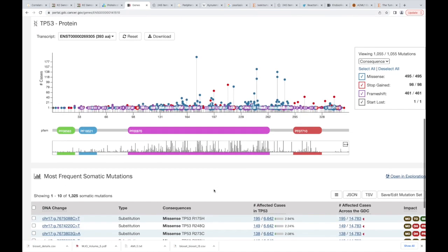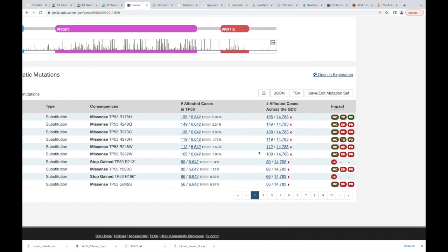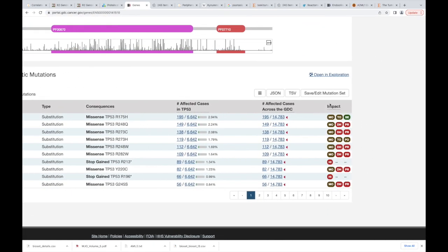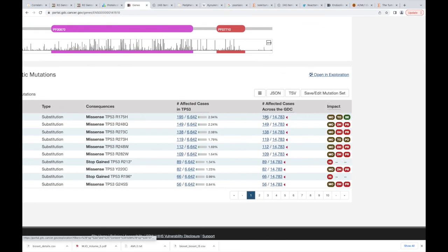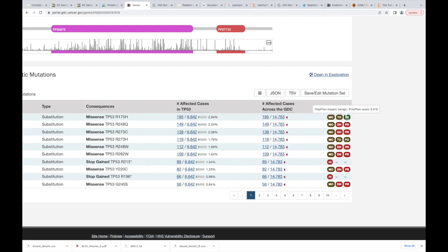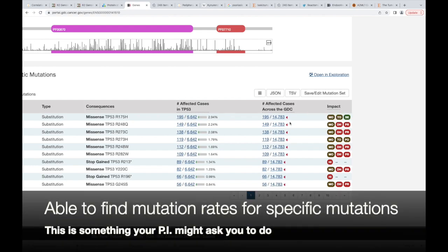You don't see... there's this line here. This is kind of the frequency of mutations, but I would bet that there is an active site. Maybe it's binding a repressor or it's binding something to this site, maybe it gets phosphorylated. Same thing here. And again, you can go through here, you can see what those different mutations are. You can see what is the impact - this is benign, this is probably damaging - and you can kind of get an idea of the type of functional changes that those mutations might make.